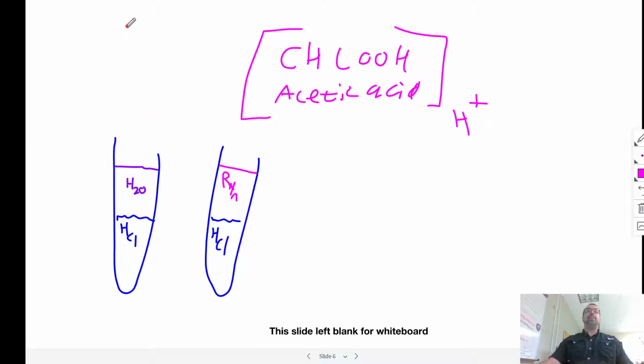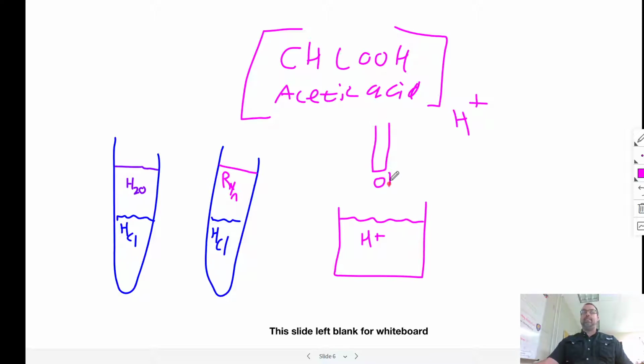And what happens in a titration is that we take some substance that's acidic. So for instance, we have a bucket of water here, and we have H pluses here, and we're going to add to that something that's basic, okay? Usually drops at a time, okay?